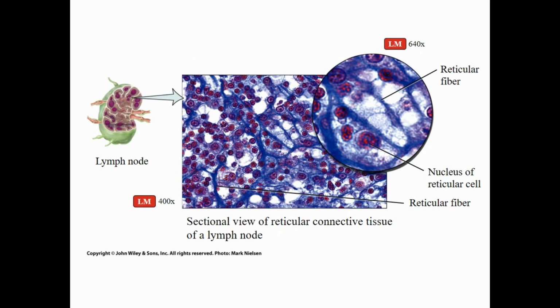And then we go to the other kind of loose connective tissue, and that is reticular. You can see it is more densely packed than the areolar, but there are still some open spaces, but it just looks tougher and thicker. And it has a lot of reticular fibers, and that is how it got its name, the loose reticular connective tissue.